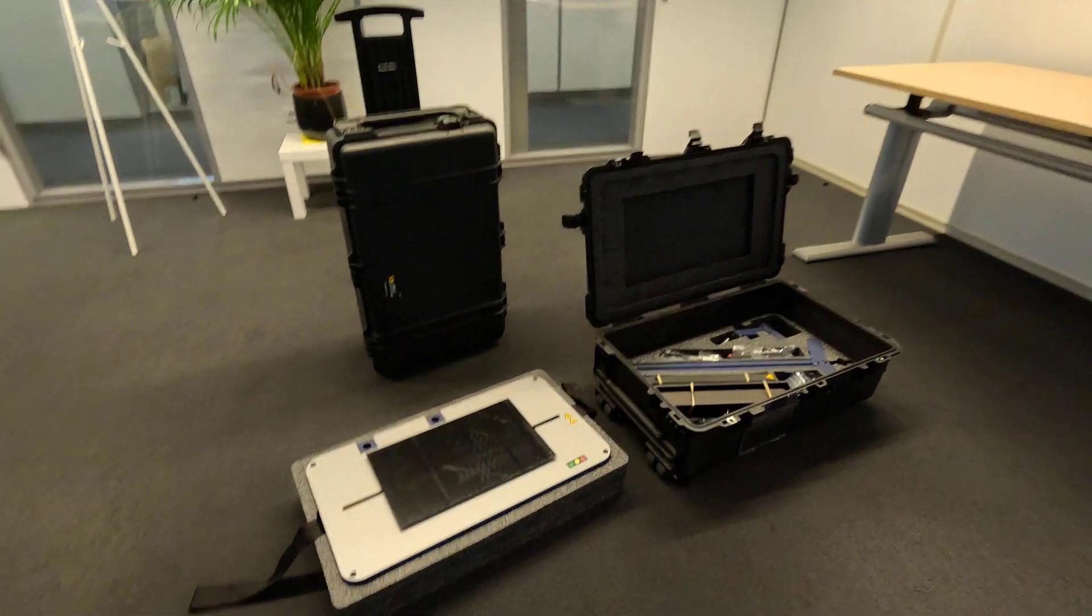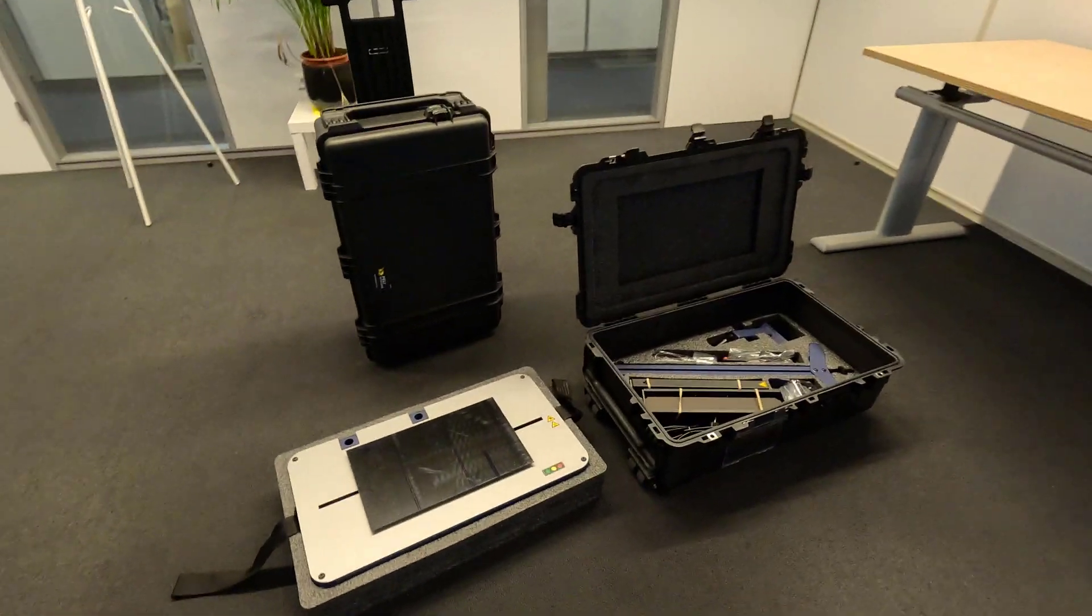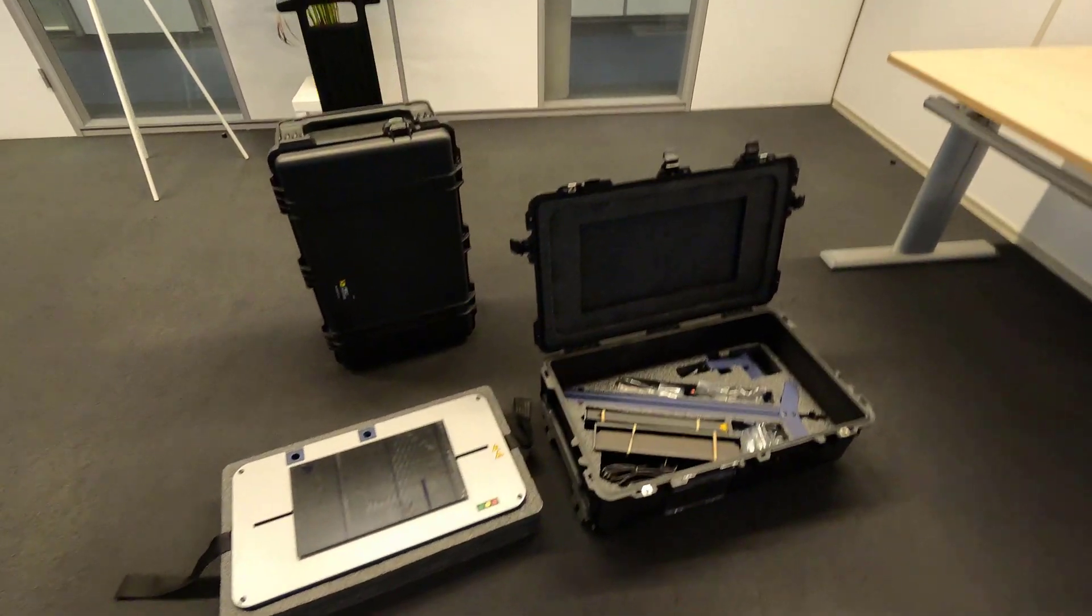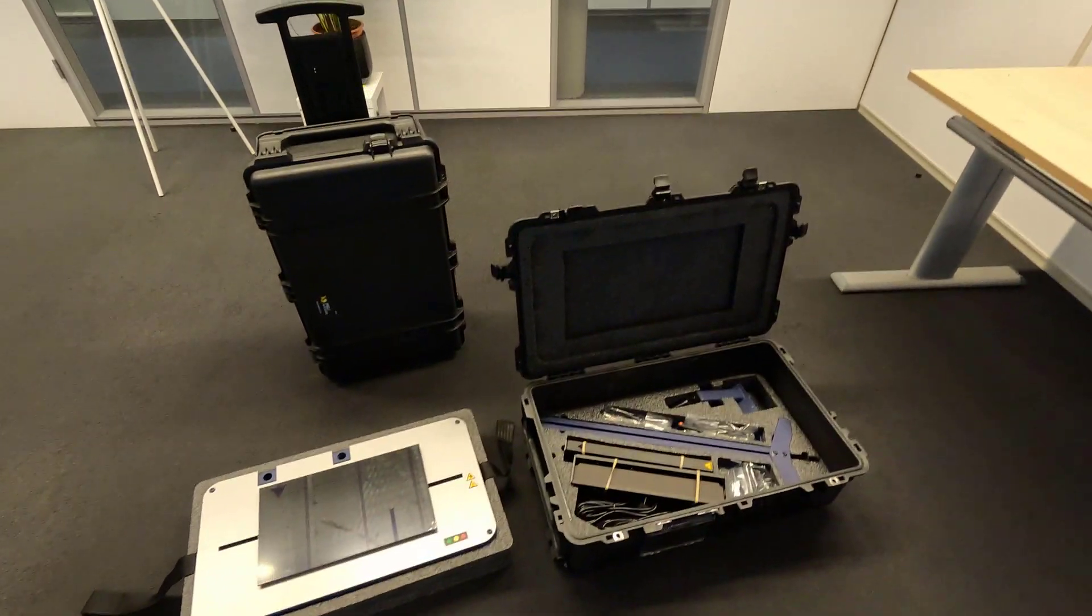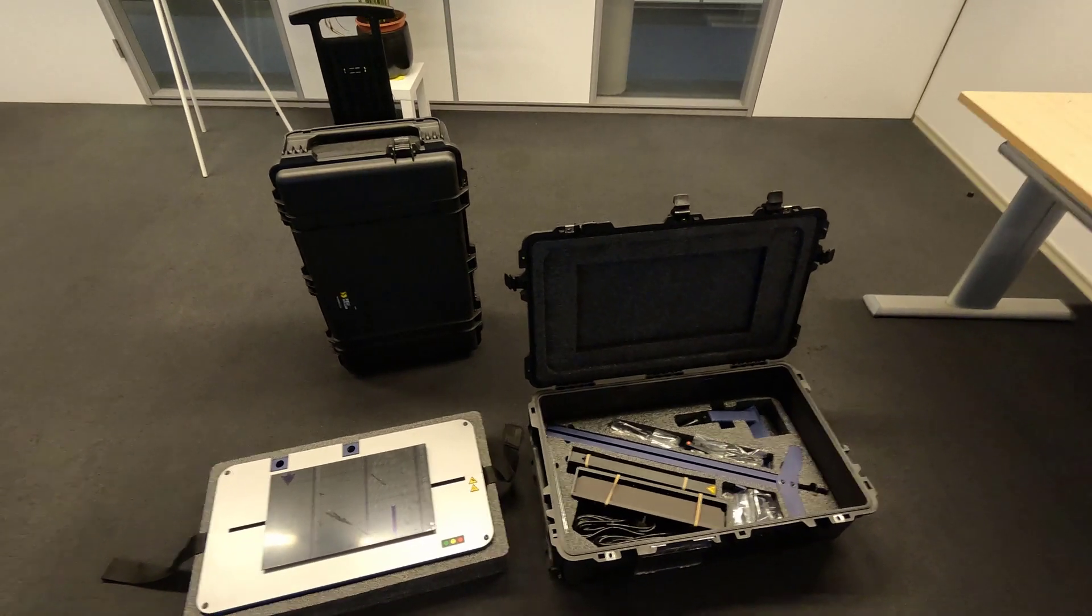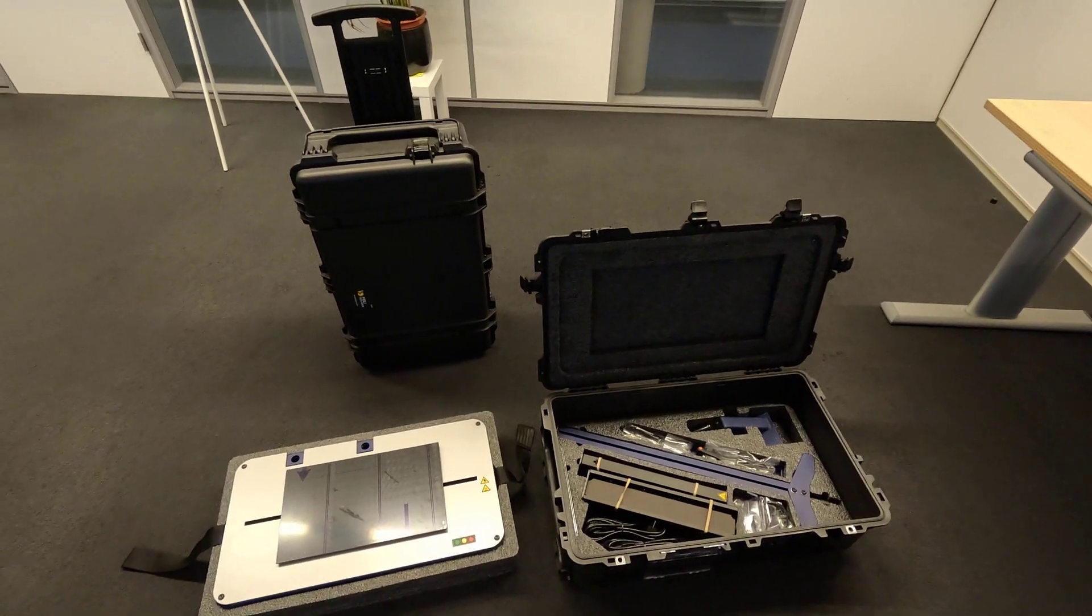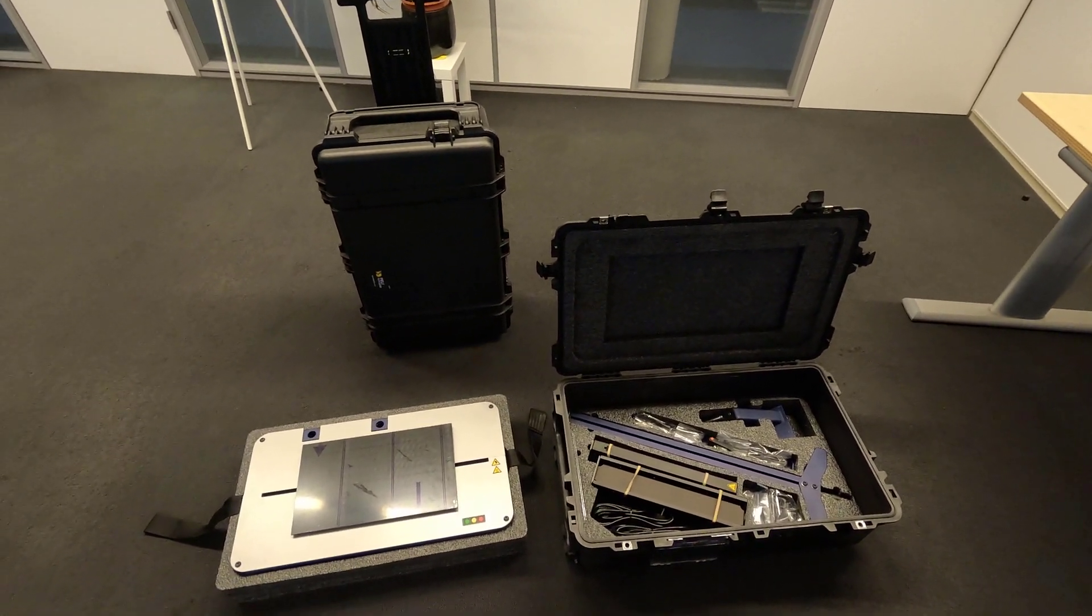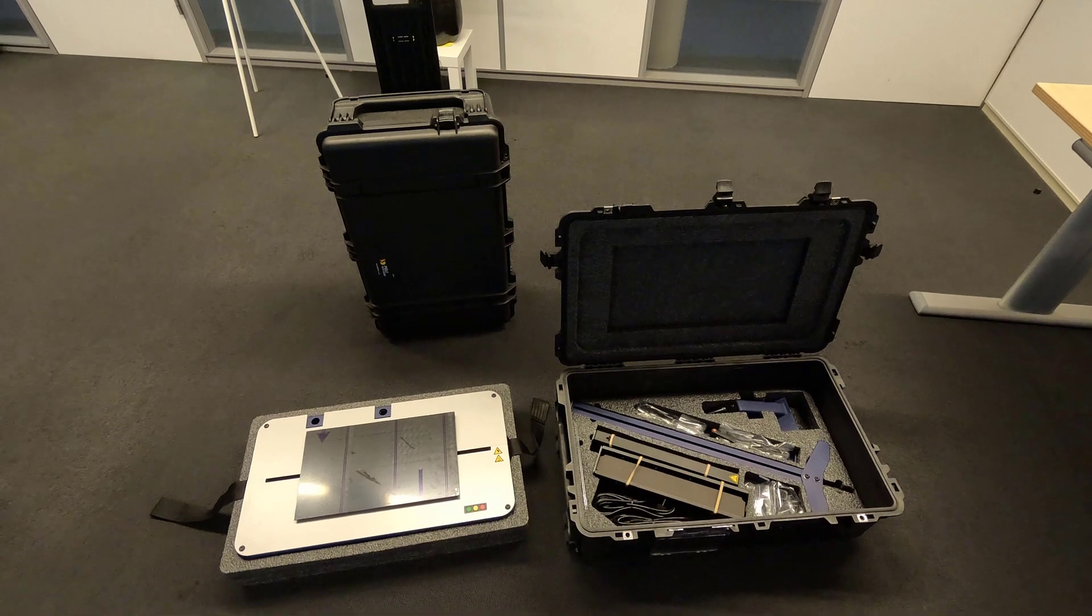The stage is easily portable. It comes in a single rugged bag and can be assembled without tools. Therefore, it allows you to bring the full setup close to your samples in diverse production environments.